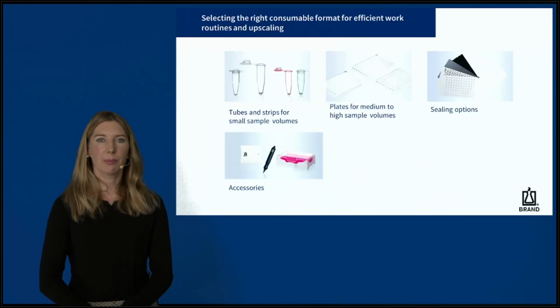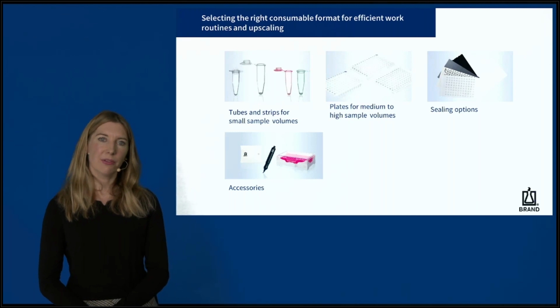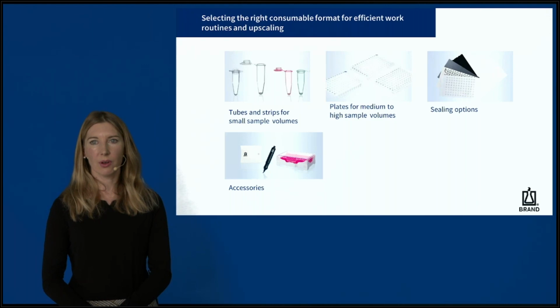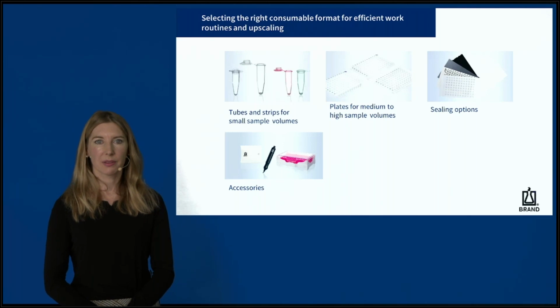Whether individual PCR vessels used for test validation or high-throughput testing of standardized processes with 96 or 384 well plates, the selection of the right consumable saves on costs and time and also minimizes waste. Therefore, before the experiment starts, plan which sample volume is necessary and which format makes sense in the experiment.